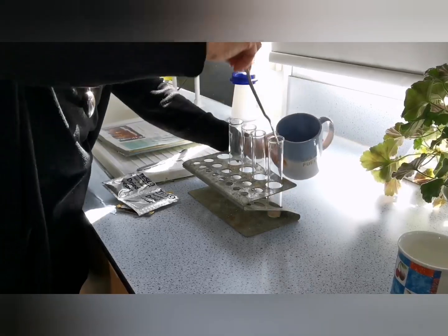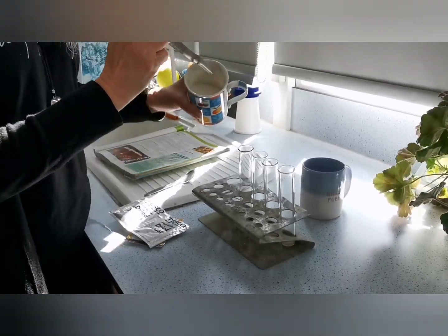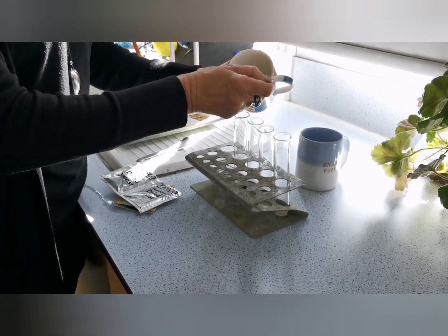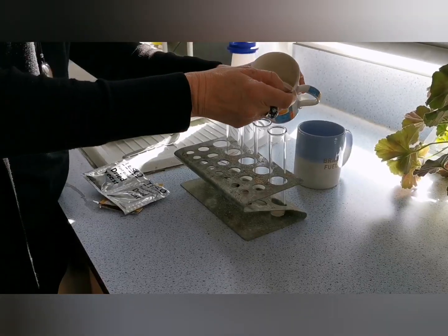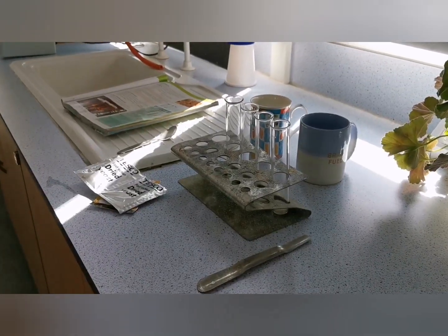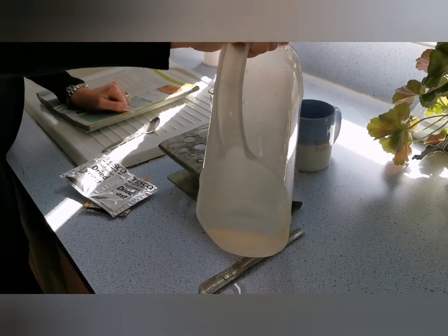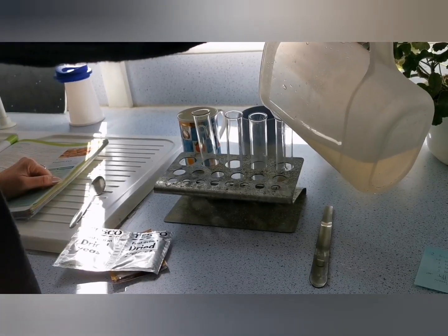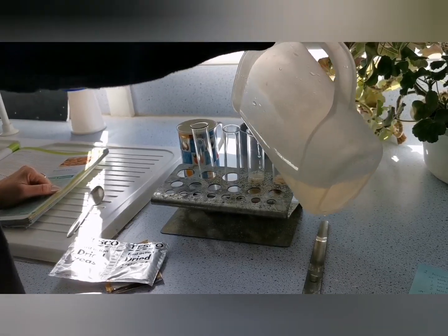And then to that, we are then going to add some sugar. So just like us, a microorganism of any kind does require some glucose. So this is its dinner, breakfast if you will. So a scoop of sugar in each as well. And then we're going to add some water to this. So we are now going to add some water to each boiling tube. Ideally, to keep the controls the same, you'd measure this out exactly. So I'm just going to try and keep it to the level of the test tube rack.